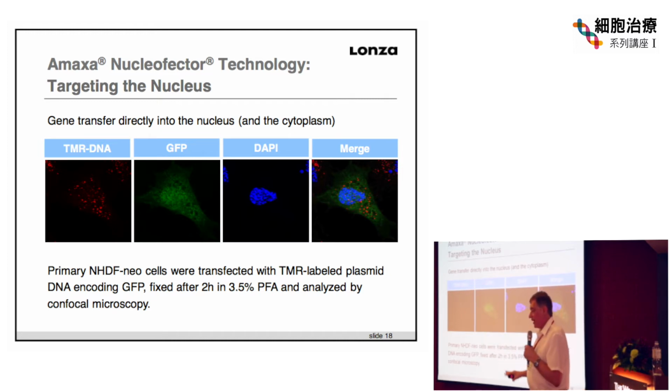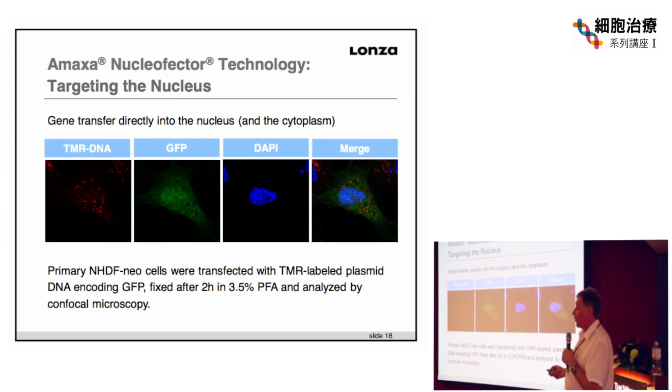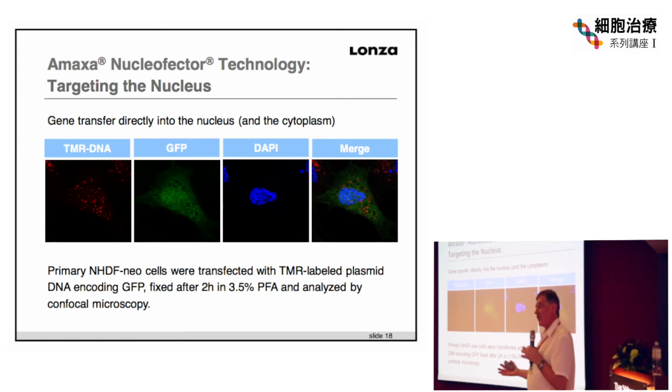Now, as we go into the genome editing part, we also transfect other substrates like siRNAs or mRNAs. siRNAs and mRNAs need to be in the cytoplasm in order to be functional or translated. Well, they're nucleic acids, so we're going to have the same homogeneous distribution throughout the cell with mRNAs and siRNAs. They'll be in the cytoplasm where they need to be functional or translated, yet the DNA gets in the nucleus where it needs to be expressed. So it's really the best of both worlds. You can see in this slide and in the previous slide just how nucleofection works and how it's fundamentally different from the other transfection technologies that are out there.